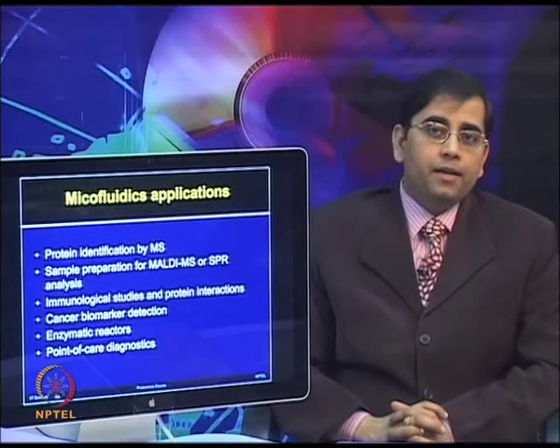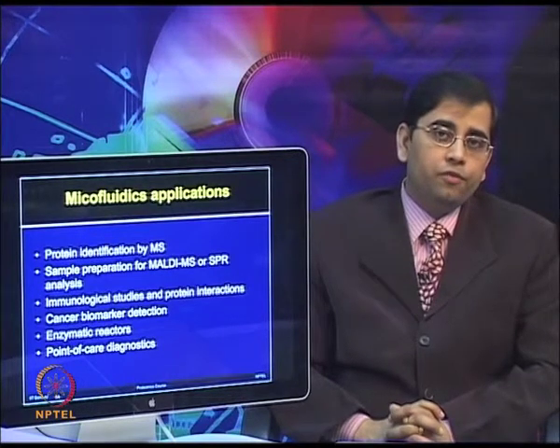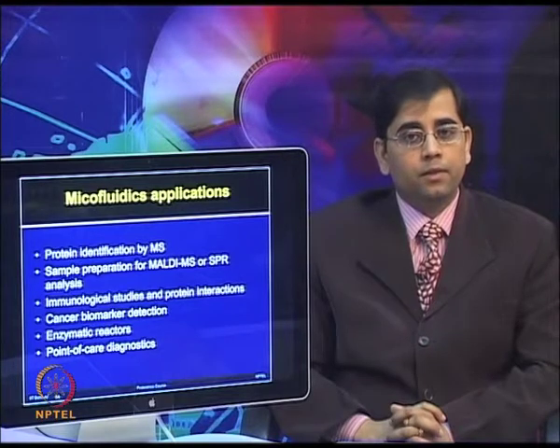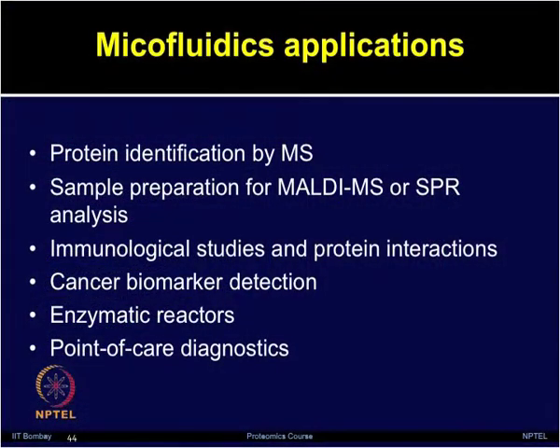Now, let us briefly look at some of the major applications of using microfluidics in the proteomics field. The protein identification is performed by mass spectrometry.